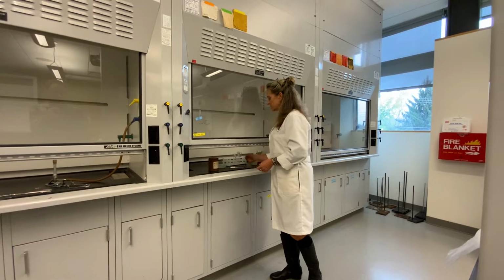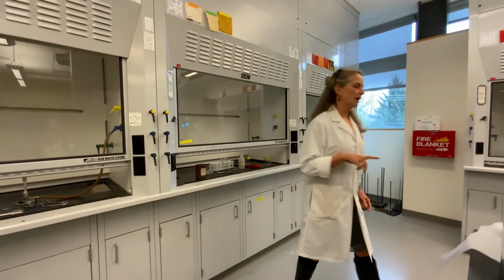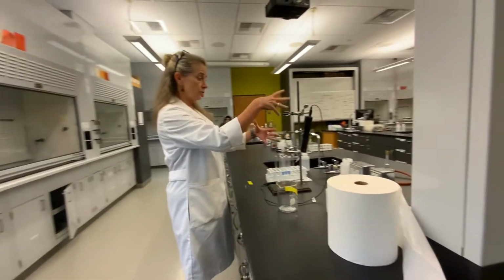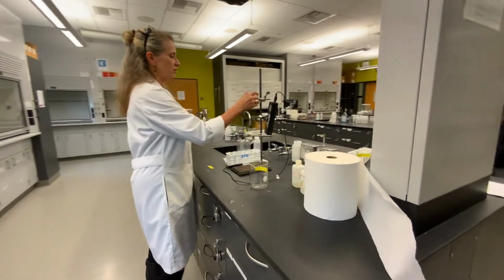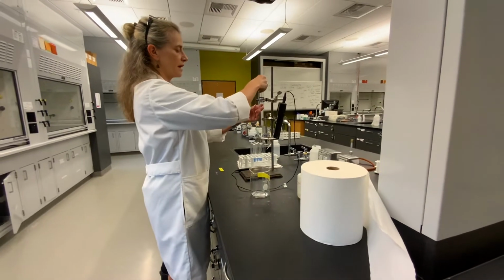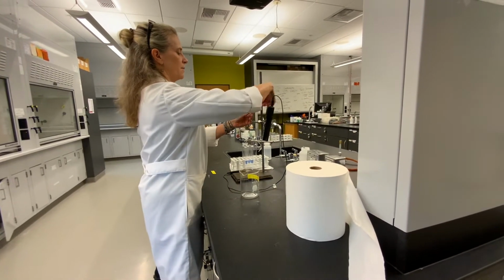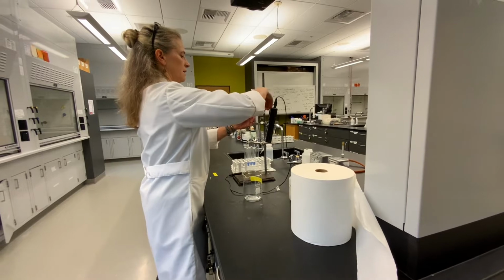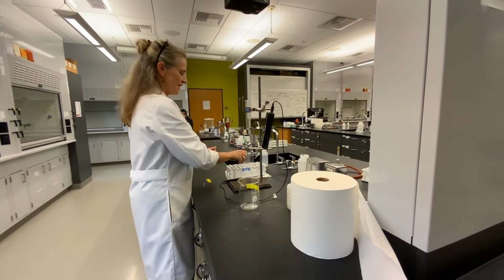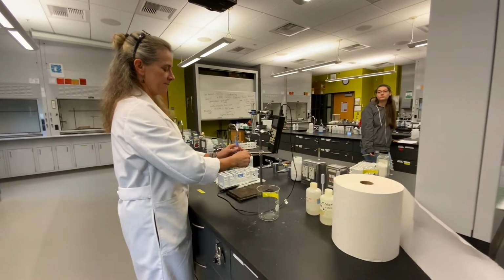Last but not least, experiment 7. So essentially on this one, you've got new things here. These are clamps that you haven't used before, so I encourage you to practice using them. That's part of this game, being in here. So you're going to put one test tube in the first clamp, better than that, and then the other test tube in the other clamp, okay?